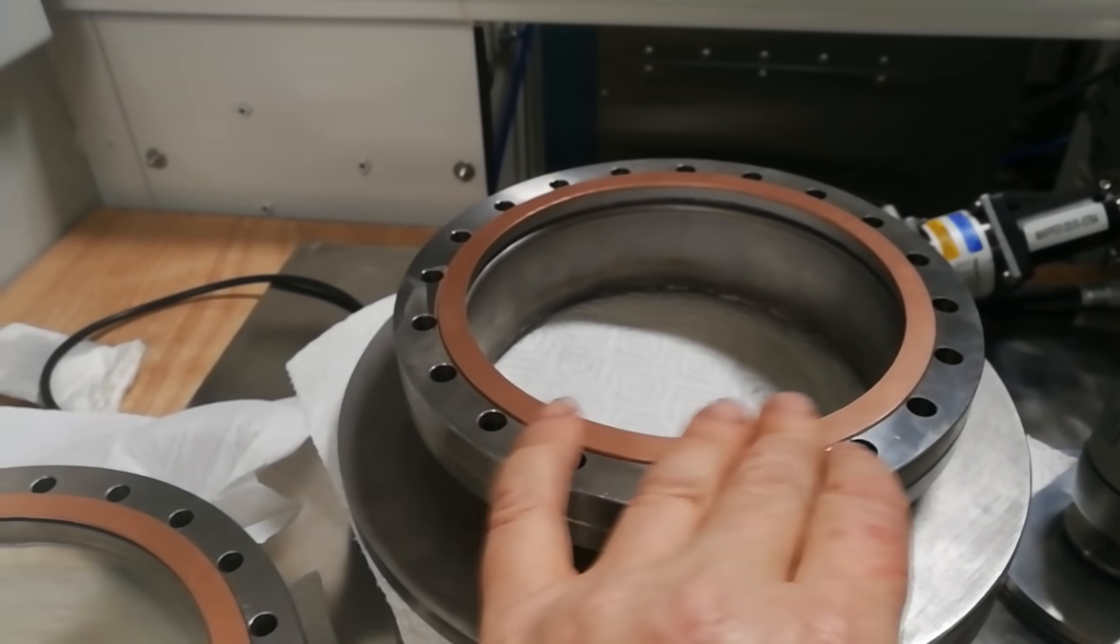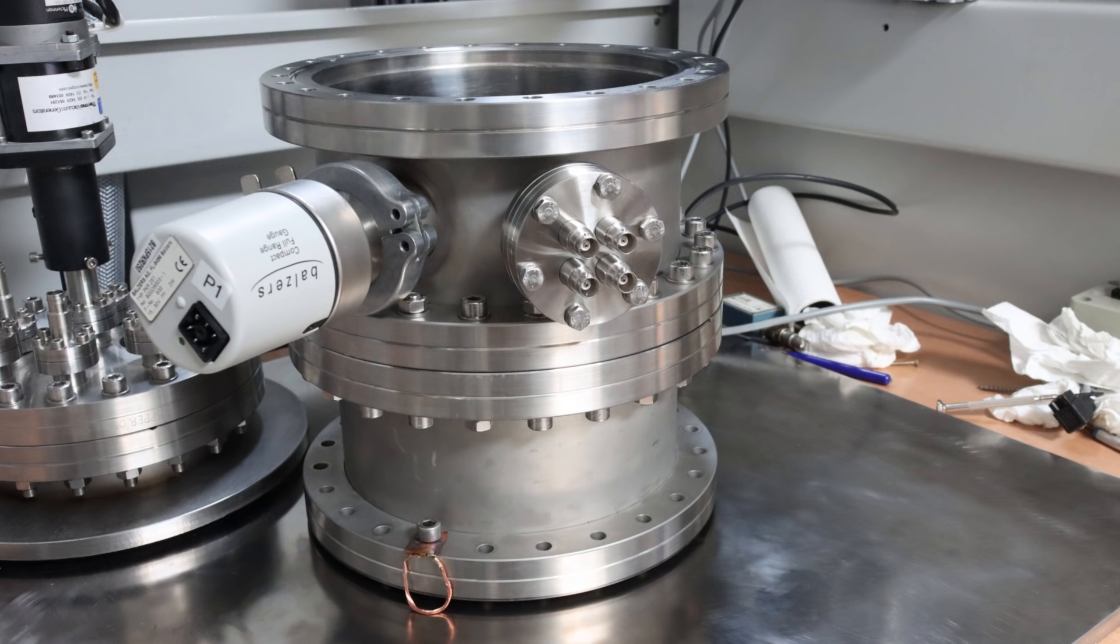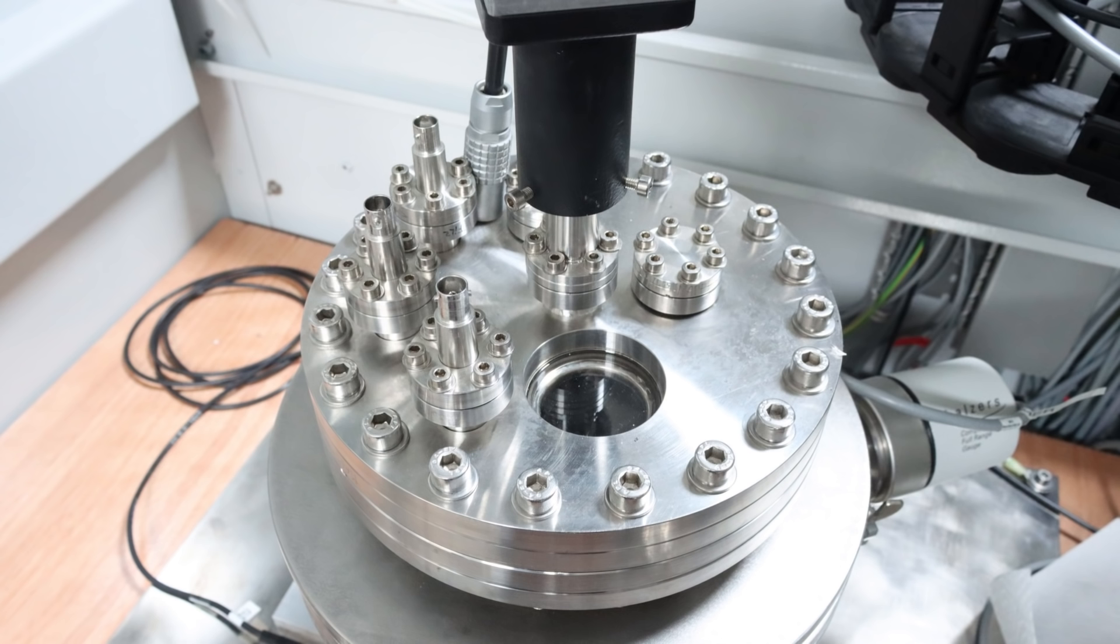The system I designed basically consists of three individual parts. A bottom plate that holds all the vacuum equipment and evaporation sources and a plasma generator. On top of that is a cylindrical chamber with several feed throughs. To close the chamber off, there is a lid that contains an optical window, a rotation axis and quite a few electrical feed throughs.